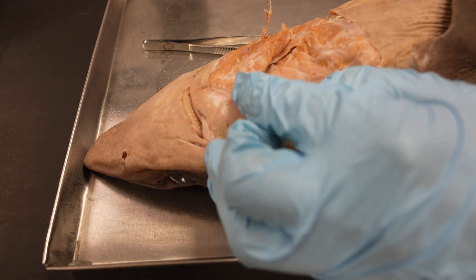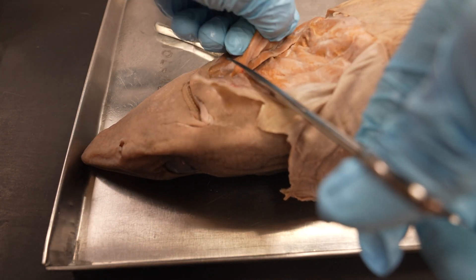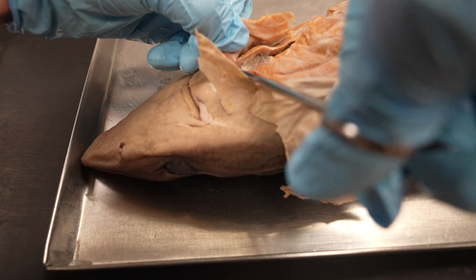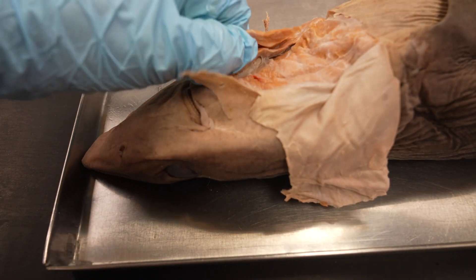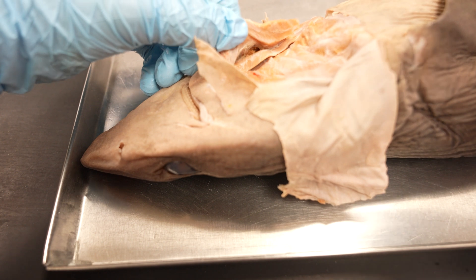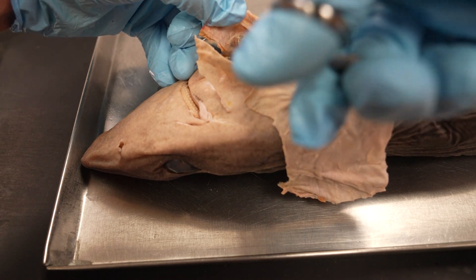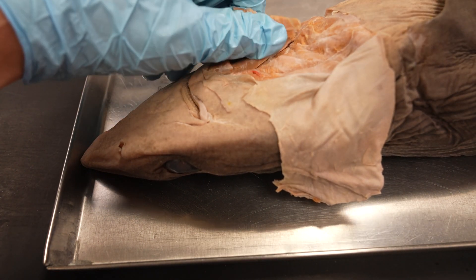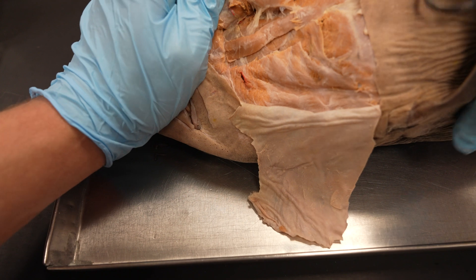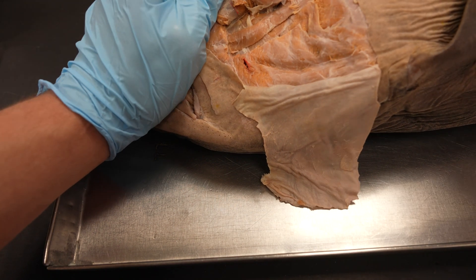That looks pretty well cleared off, so let's cut over — I'm going to clear it transversely. Try not to rip it as we go. I might have to clear out a little bit more here so that it doesn't take that coracomandibularis with it. That's looking pretty good. Now I'll just have to take scissors or a probe and clear out some of this fascia so we can see the muscles a little more clearly.